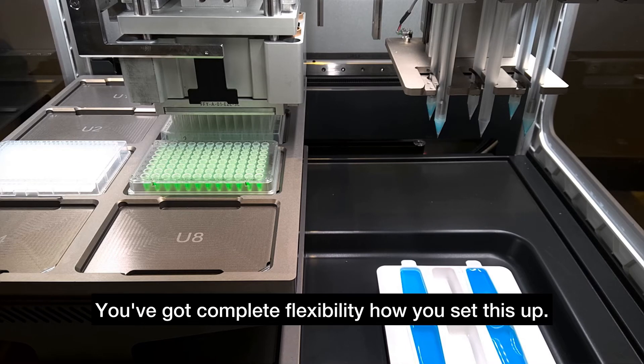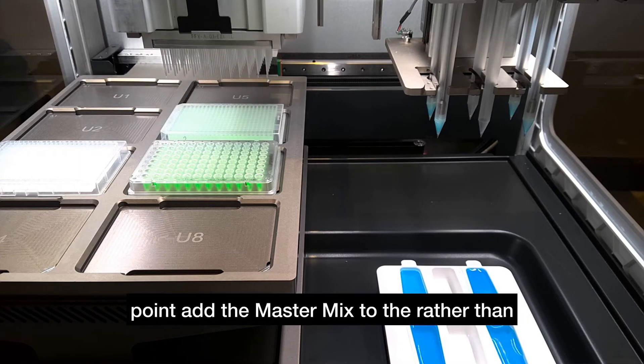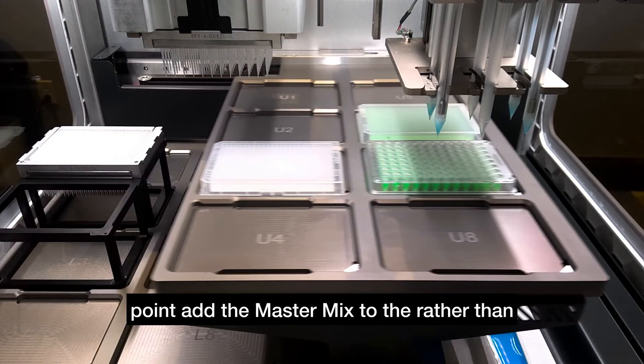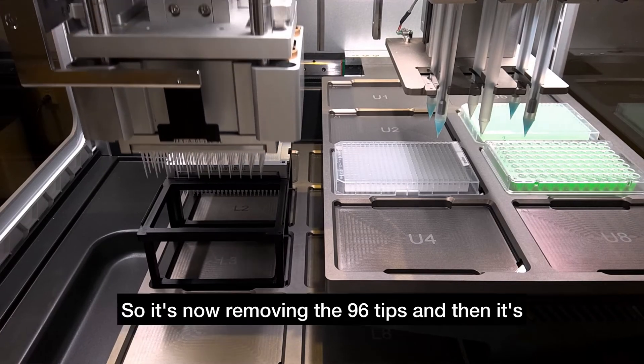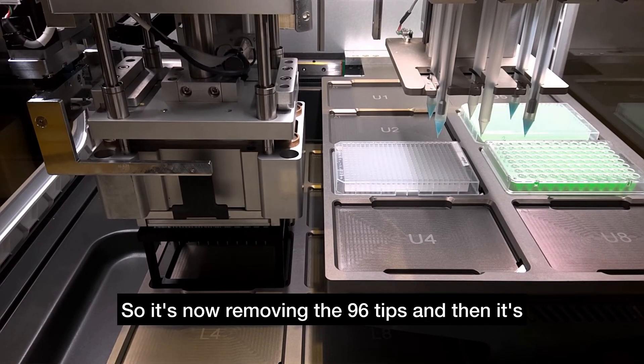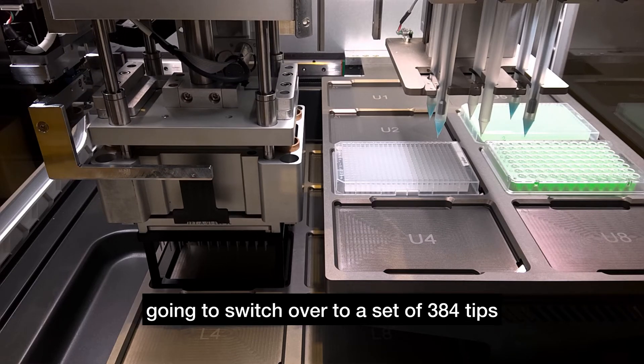You've got complete flexibility how you set this up. As I mentioned, you could add the master mix to the 384 well plate rather than to the source 96 as we did. It's now removing the 96 tips and then it's going to switch over to a set of 384 tips for the final step.